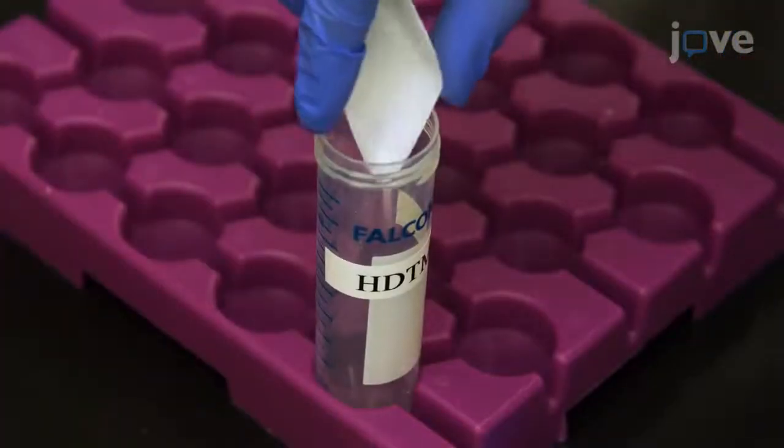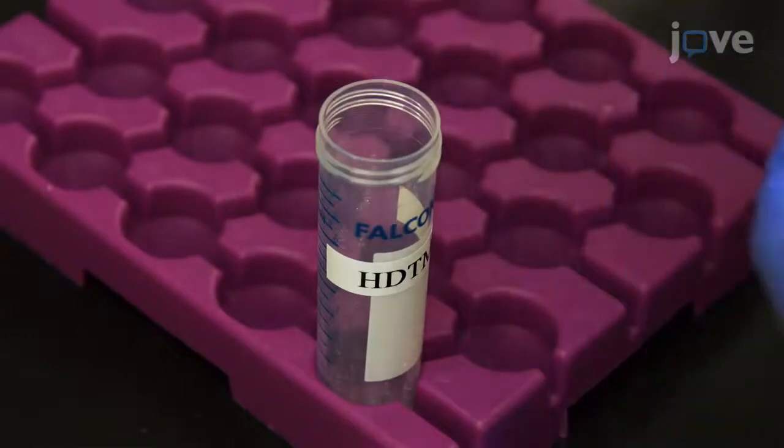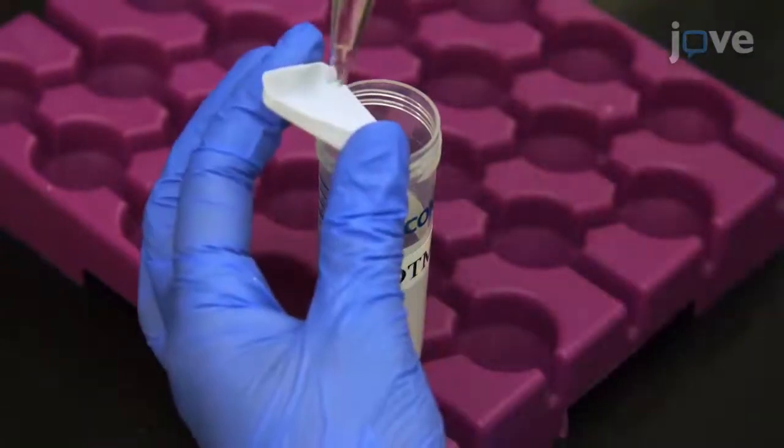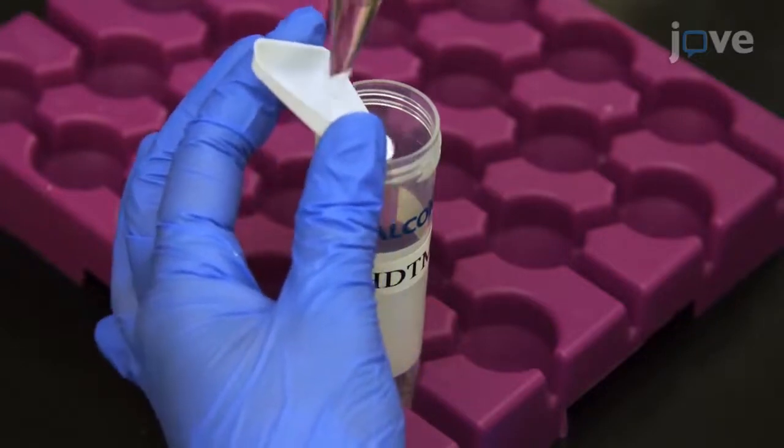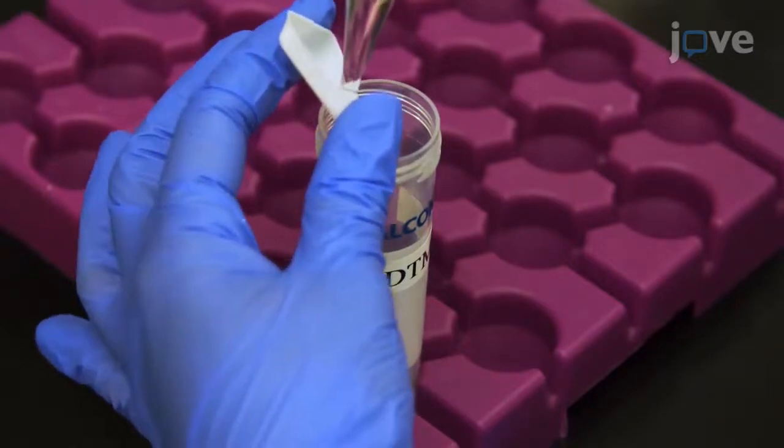Prepare HDTMA by adding 0.0365 grams to 20 milliliters of double deionized water and place the solution in a water bath at 37 degrees Celsius to promote solubilization.